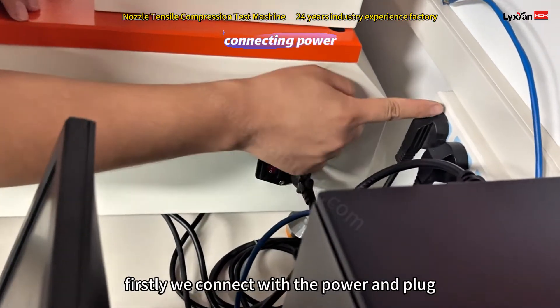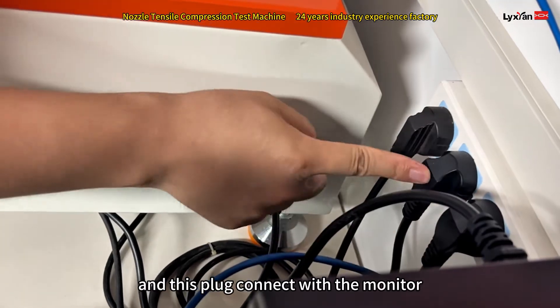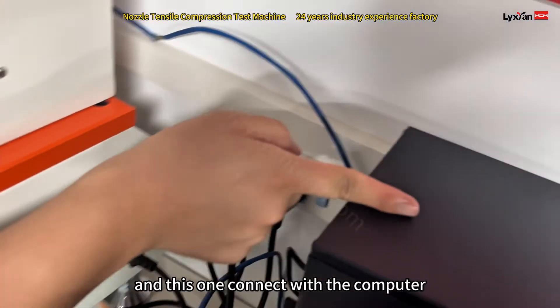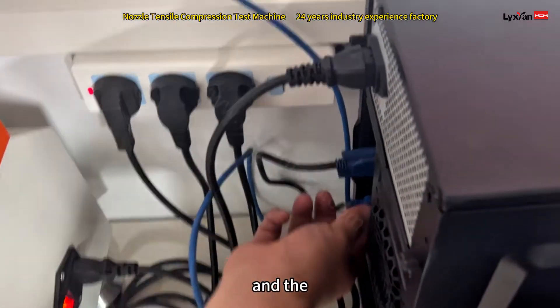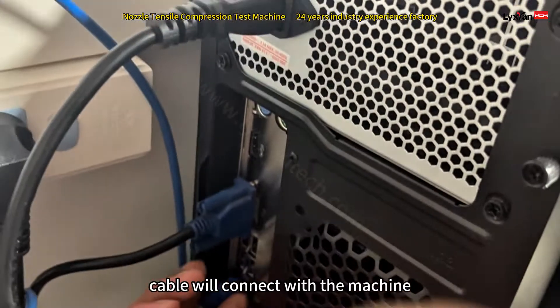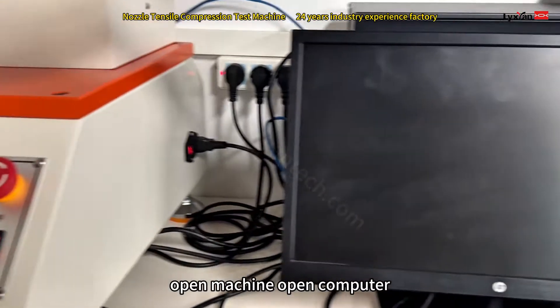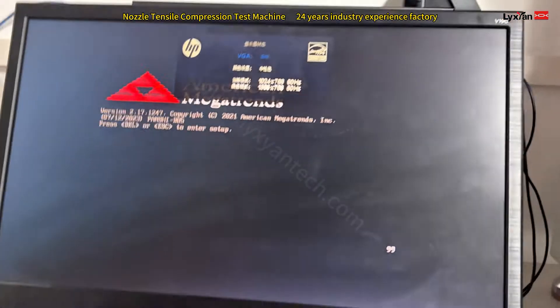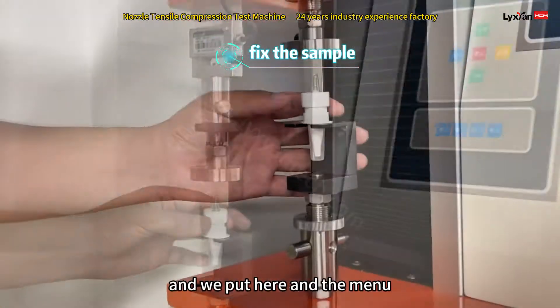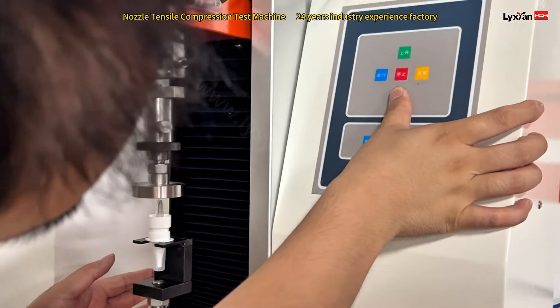First, we connect the power plug. This plug connects with the monitor, and this one connects with the computer. Here, connect with the machine and open the power. The cable connects with the machine on one side and here on the other side. Open the machine, open the computer. Now we put the sample here, and operate the panel to conduct with the sample.